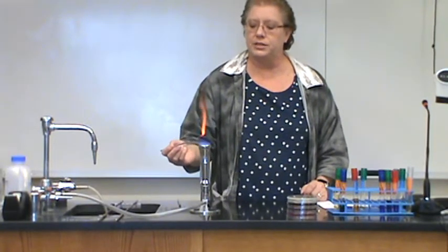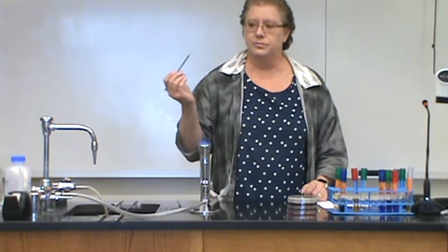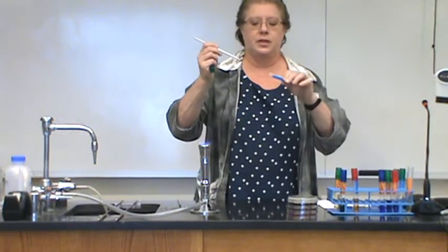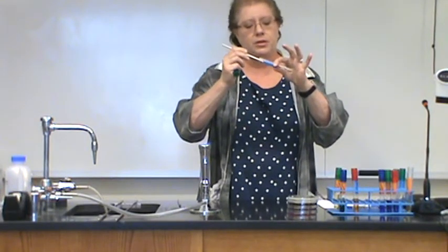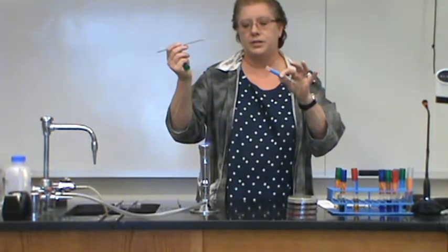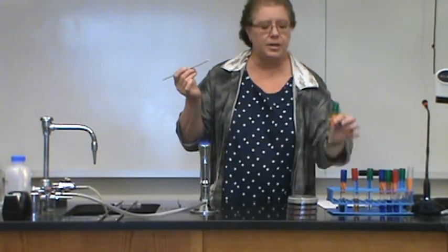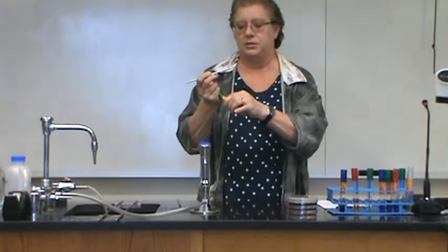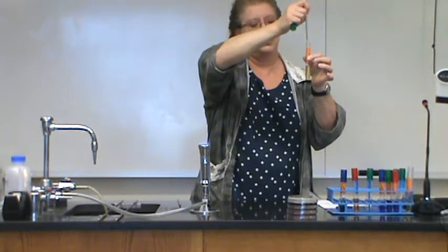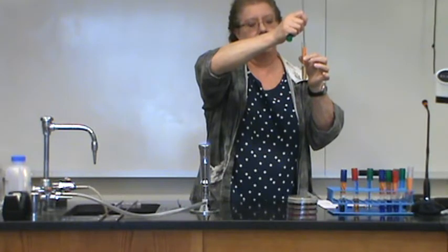So what you're going to do is, just like a loop, you will sterilize it. Then you pick up your unknown sample. Again, cool it like you would a loop. And go in and wiggle it around in there so there's bacteria on the needle. Sterilize the top. Put your unknown down. Then pick up your SIM media. Flame the top. And then what you're going to do is stab this directly down into the SIM media.